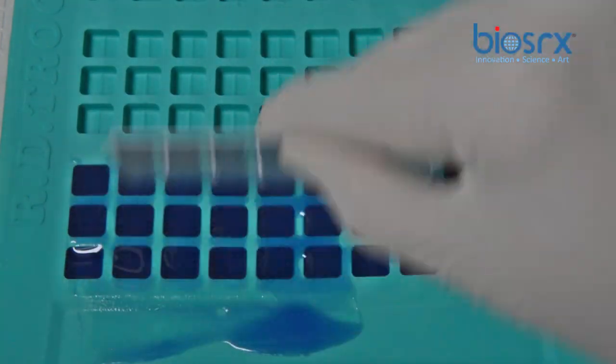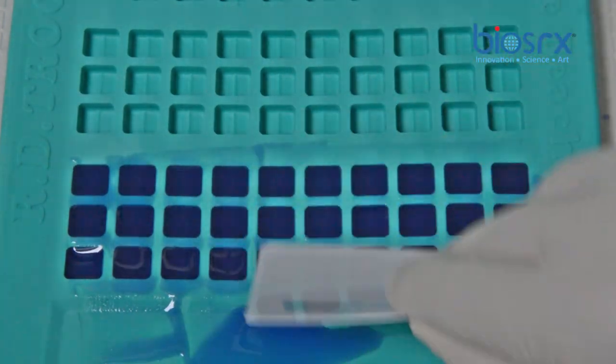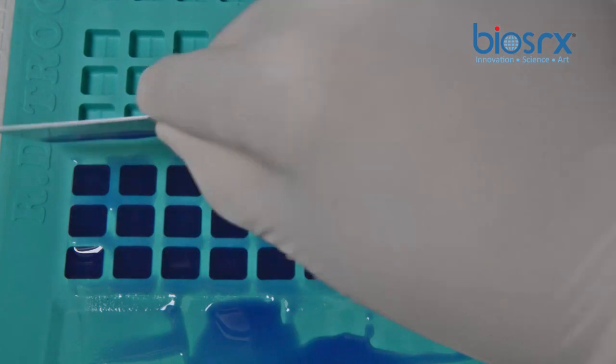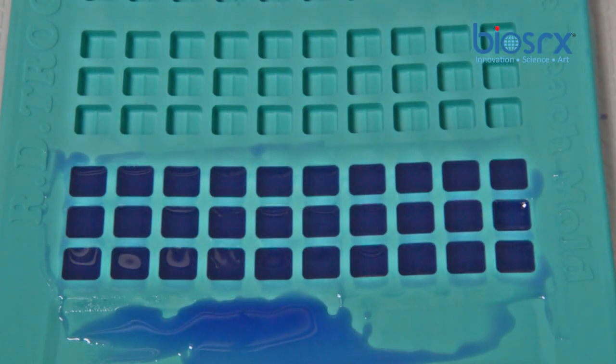One of the additional benefits for these RD trochee molds is the trough. The trough allows for clean removal of excess material when compounding multiple trochees at a time, something that most other competitors are unable to provide.